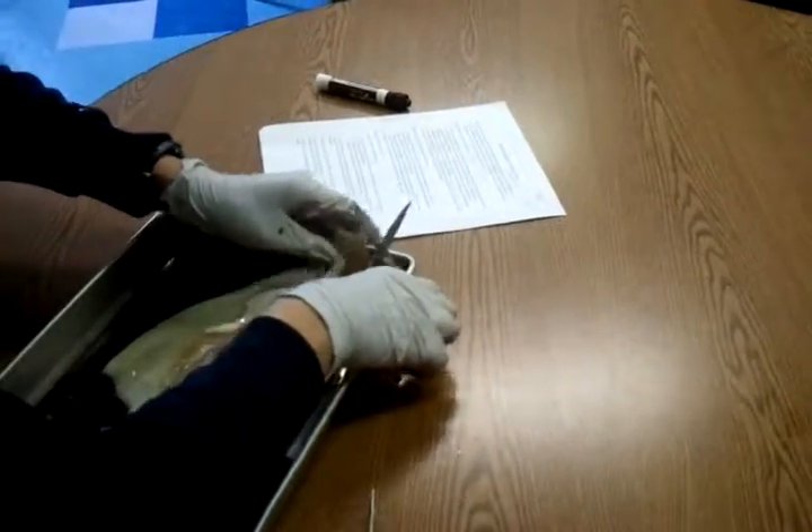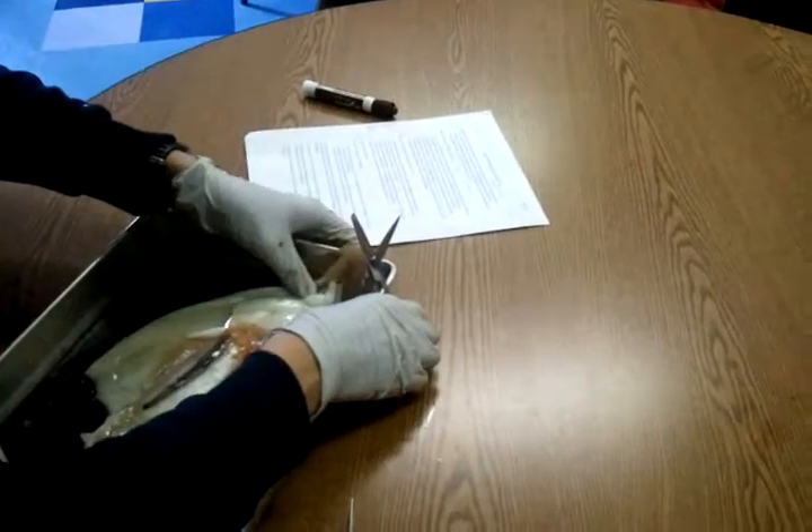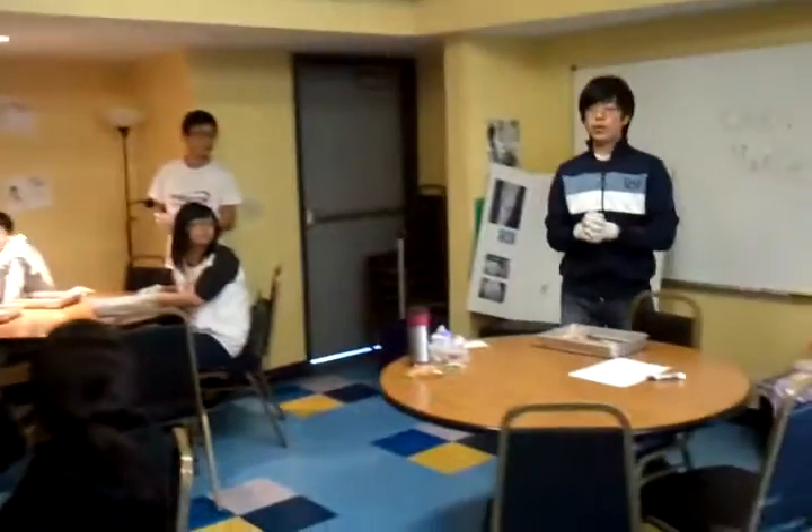Let's cut open this little sucker here. All right. So the female... is this a fish?